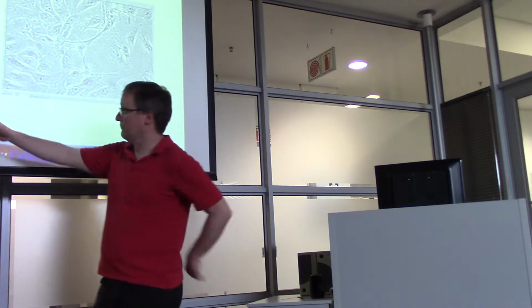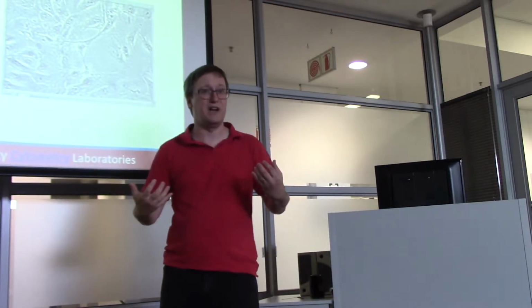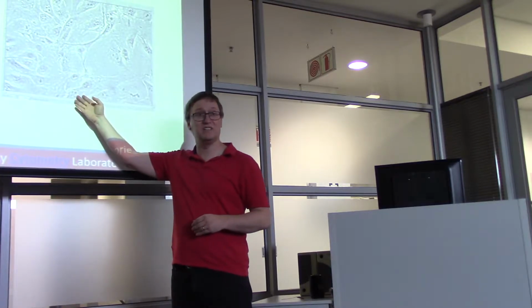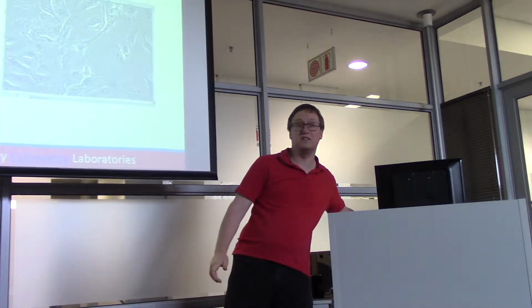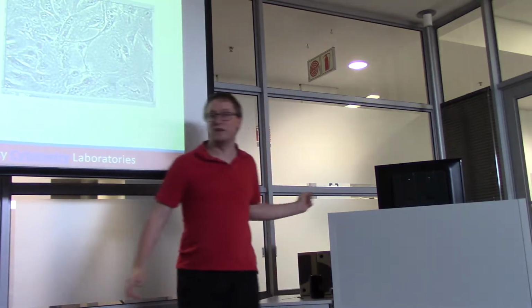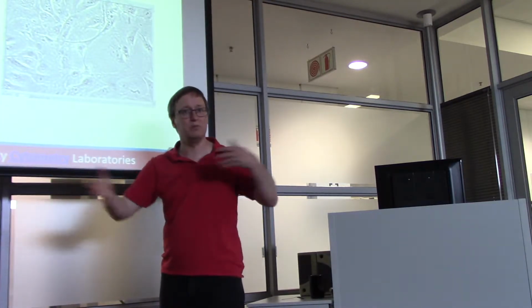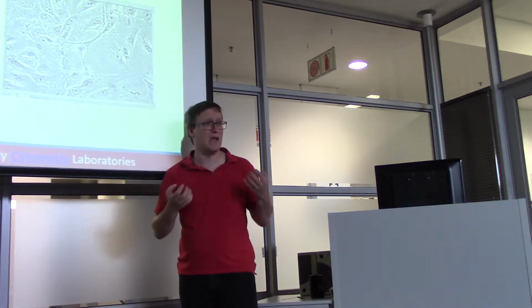In this case, by using the histogram of intensities that we originally collected, we can figure out where the informative content is, set up our brightness and curve function, and now a much easier to interpret image has resulted. So we may have started with this, we tried brightening it to begin with, but then found that if we optimized our color function, our mapping function between input and output brightnesses, we got a lot better contrast out. Contrast is how you get information out of biological imagery.